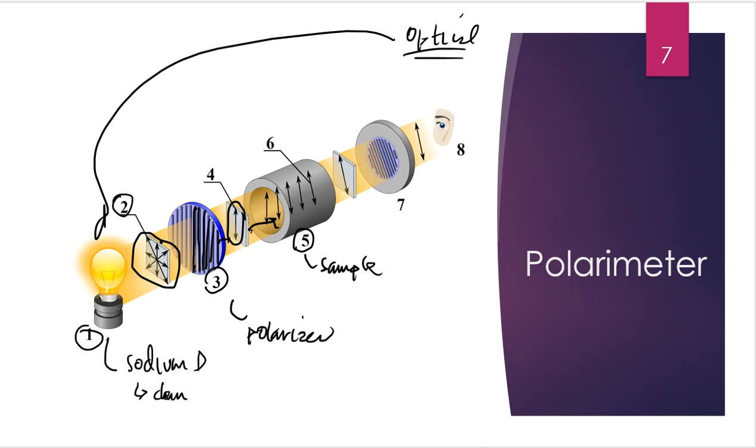In spot number 5. And what's happening is that my sample, if it has chiral carbons, an asymmetric carbon, because they mean the same, then that means there are 4 different groups attached. And that means that it's going to take this light and it begins to tick, tick, tick, all the way around. So it's either going to go left or it's going to go right, but it's going to rotate. And this is great news because that's what we want it to do.